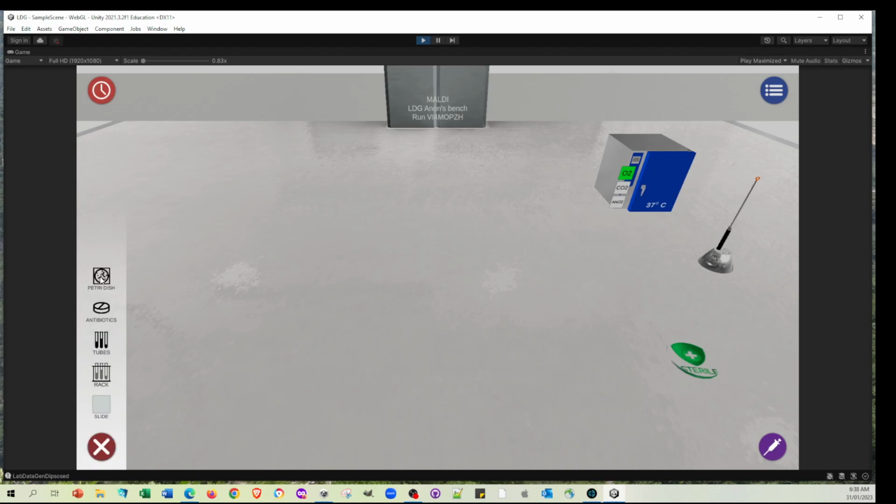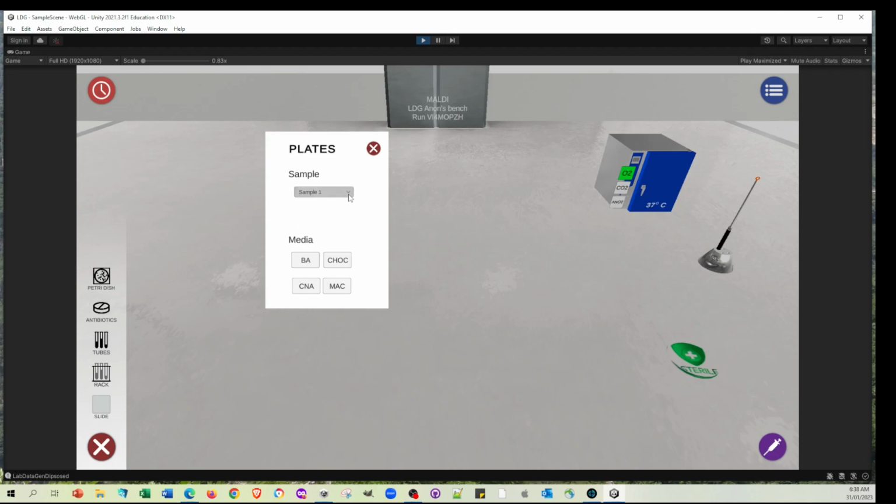But the main thrust of it is that you can generate samples, and the database makes it possible for these samples to be generated outside of Unity. So the dream here is that you can say, well, I want a sample that will contain the following three bugs, and the system will know that sample number 12 is that.